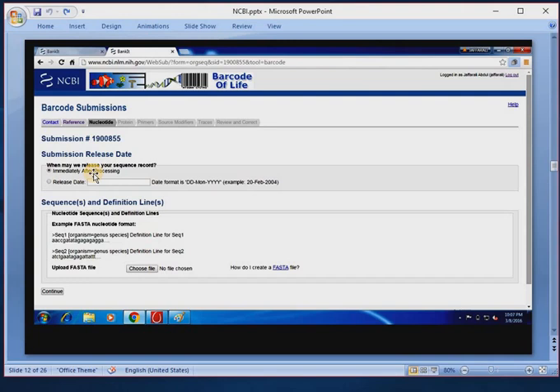They will check the quality of the sequences, the originality of the sequences, the chromatogram, and all the information we have given, with their own software. If there are no errors or problems in our submission, after 15 days they will mail you that your sequences are ready. Within another 2 or 3 working days, your sequence will be published to the public portal in the NCBI or BOLD. They will ask for your approval. If you reply to the mail immediately, within 3 or 4 days your sequences will be published in the NCBI.